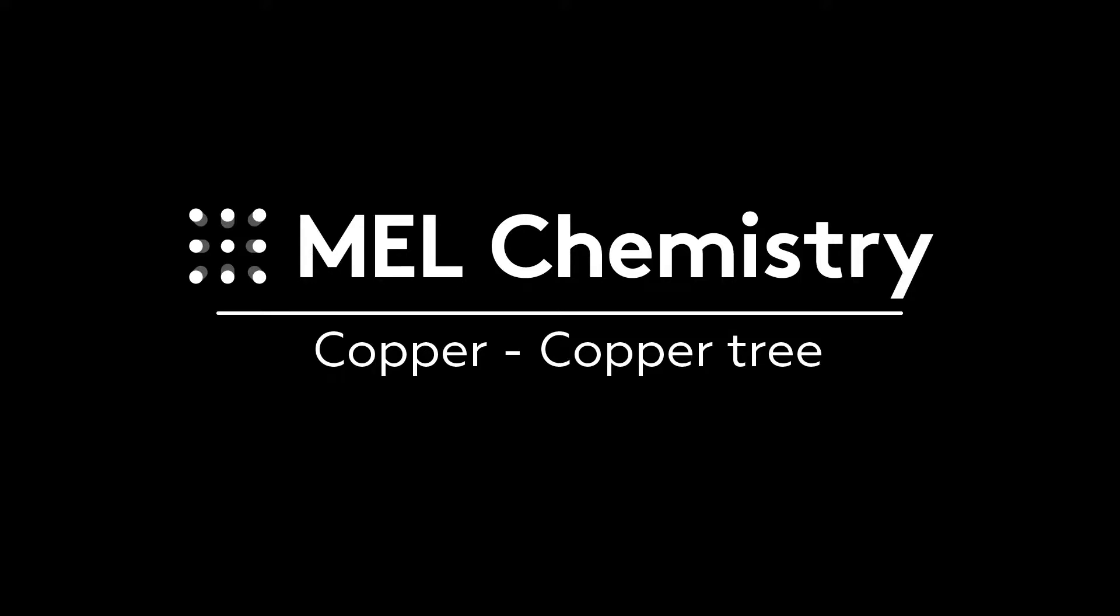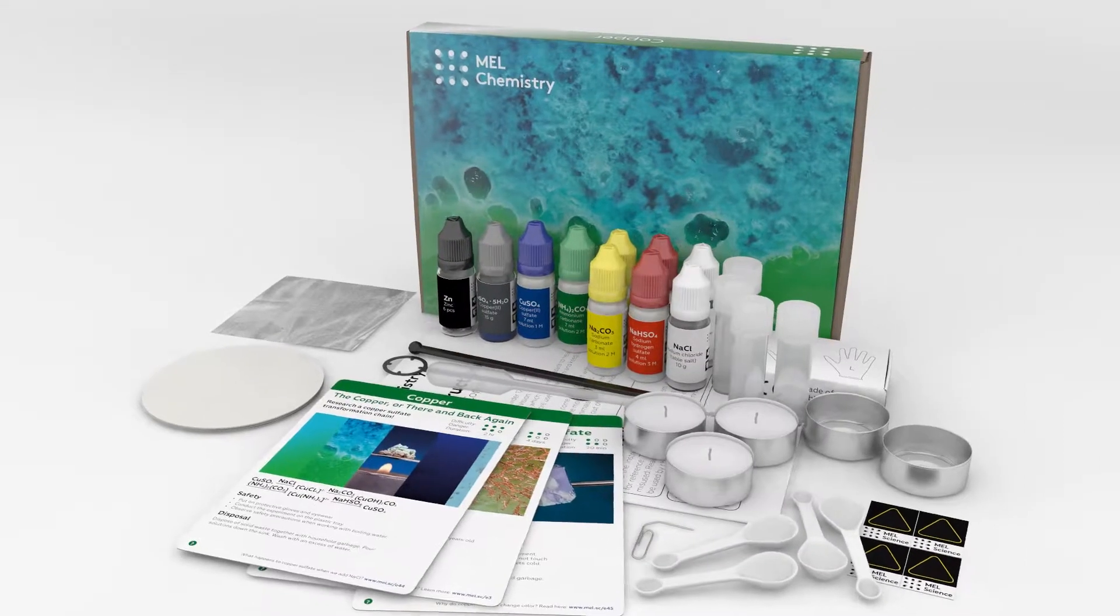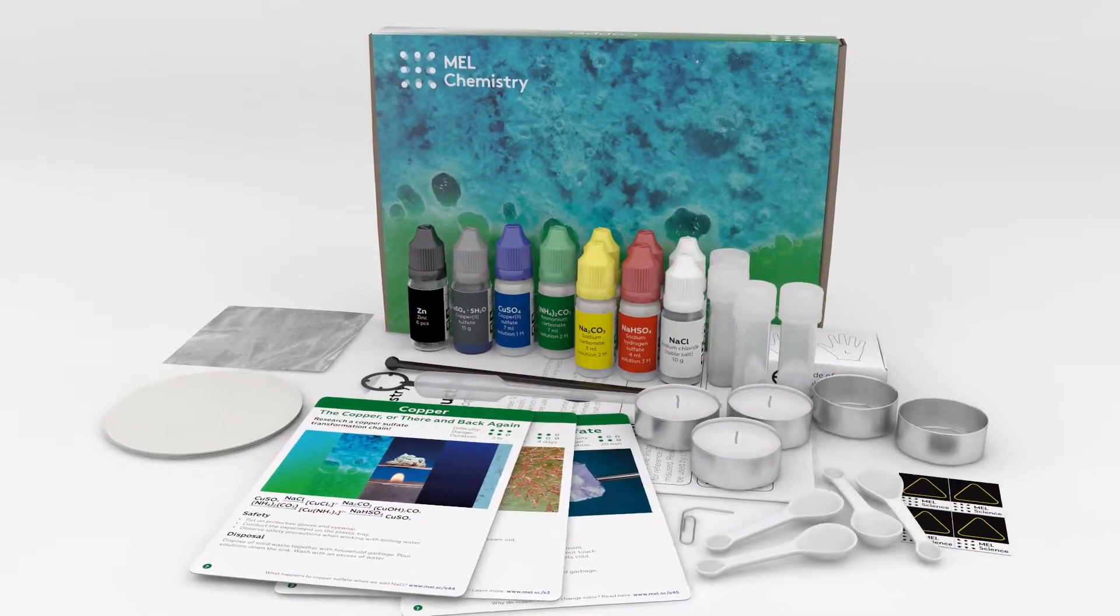Welcome to the wonderful world of chemistry. Today with the copper experiment set from MEL Chemistry, we will grow a copper tree.